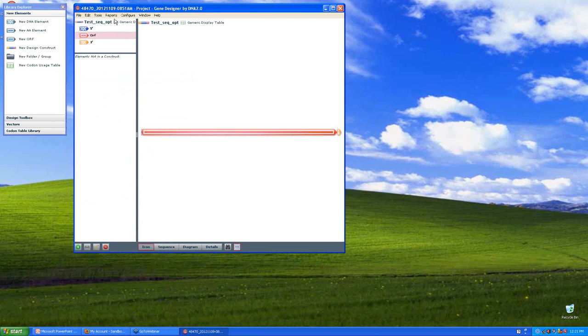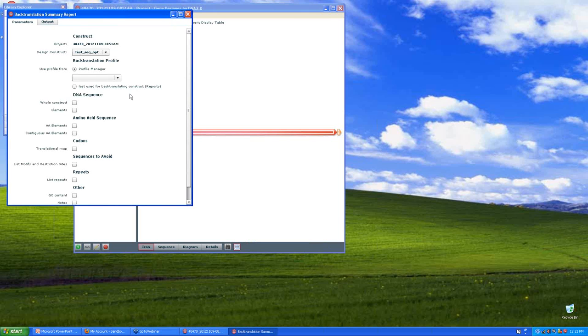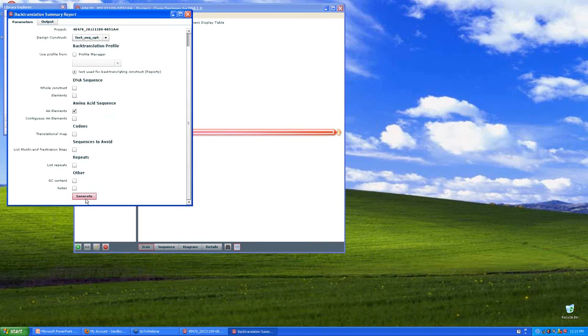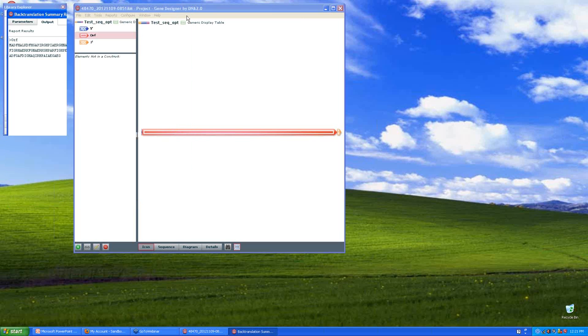Or if you went to reports, back translation summary report. And if you use the last used back translating construct and just ask for the amino acid. And there it is. Now obviously you can copy and paste this into text pad or word pad or notepad and then do an alignment with your amino acids.